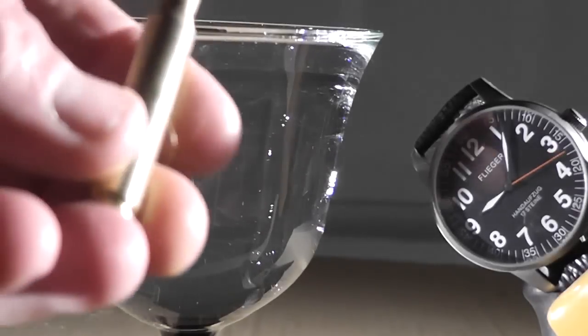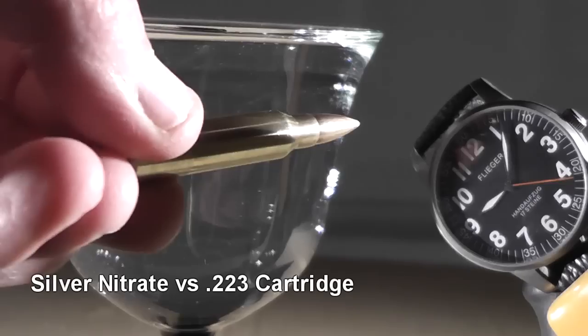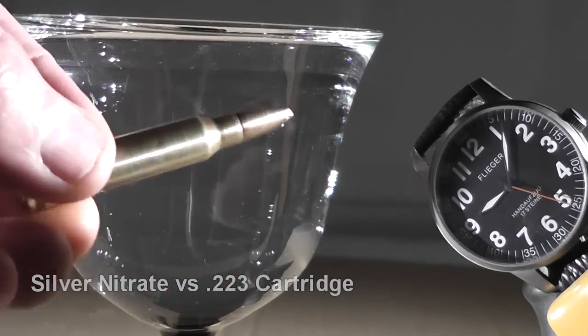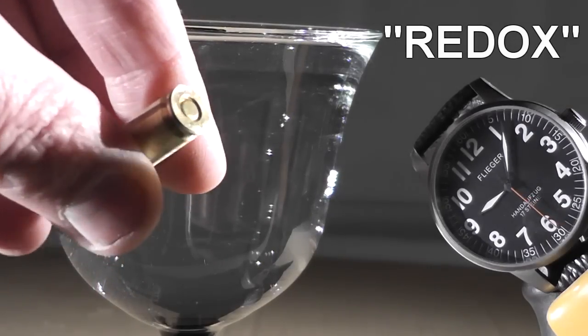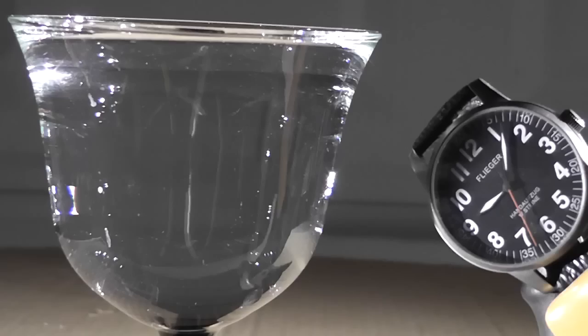Hello everyone, this is Jeff Vitale, Flightermouse. We're going to take a .223 rifle cartridge and put it in silver nitrate. This type of reaction is simply called a redox reaction, or oxidation-reduction reaction. Normally a piece of copper wire is used, but we thought a live round used in an AR-15 rifle would be a little more exciting.